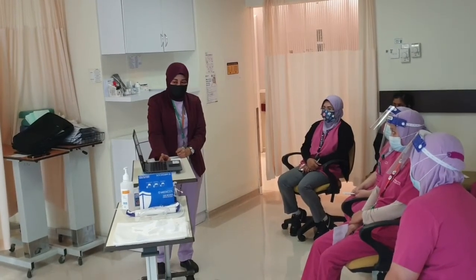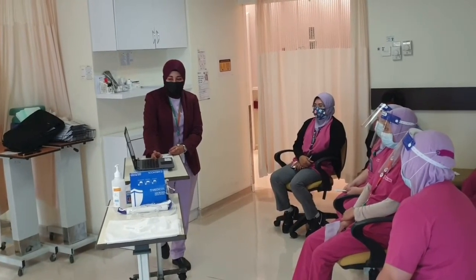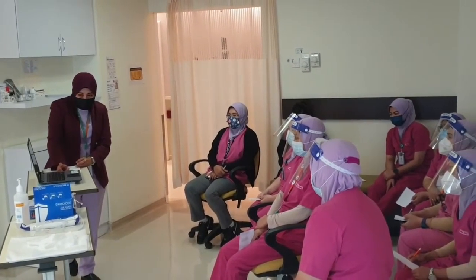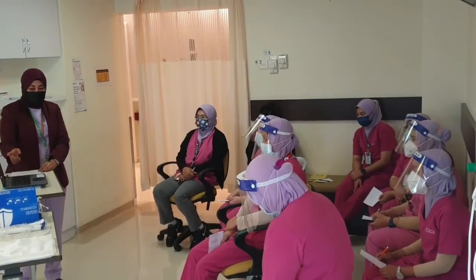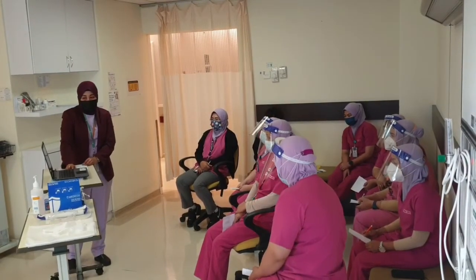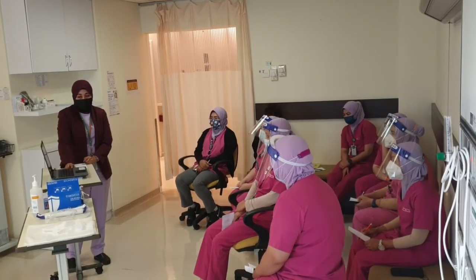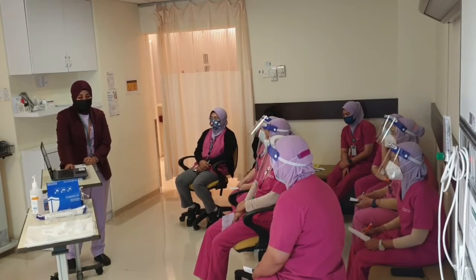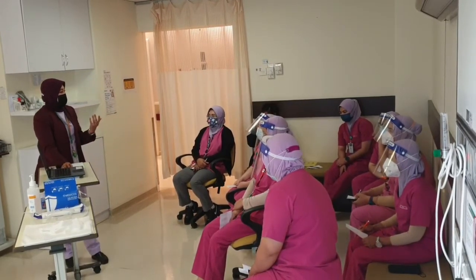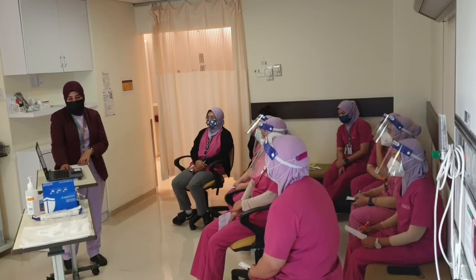Okay, now going to respirator. A respirator is a protective device worn by healthcare personnel to protect them from inhalation exposure to airborne infectious agents. Are you familiar with this one? Yes. Okay. For example, the N95 is a disposable particulate air-purifying respirator used most commonly in healthcare, and we also have N100. By the way, in this hospital setting we use the N95.